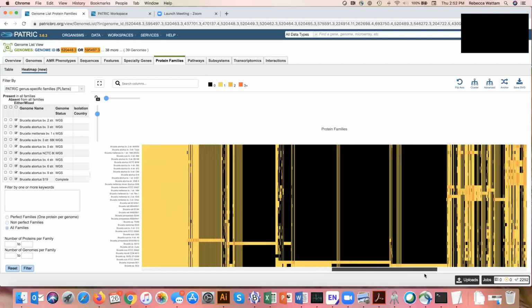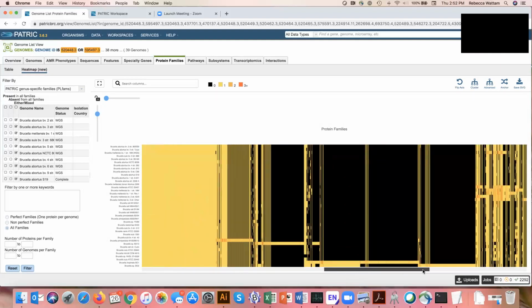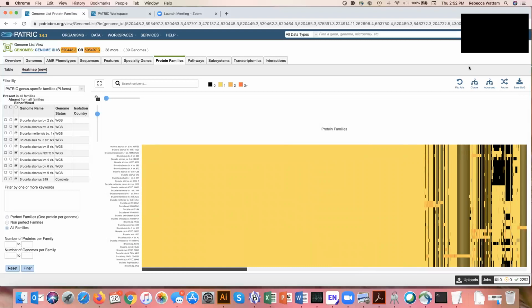If I look there, I notice these genomes are from the Brucella that have been isolated from marine mammals. You can continue on down until you get the ones that are singletons for particular genomes, like these, which are all from Brucella inopinata. And scroll all the way and see all the patterns within them. So generally, I'm looking for a nice picture and an easy way to see the data.